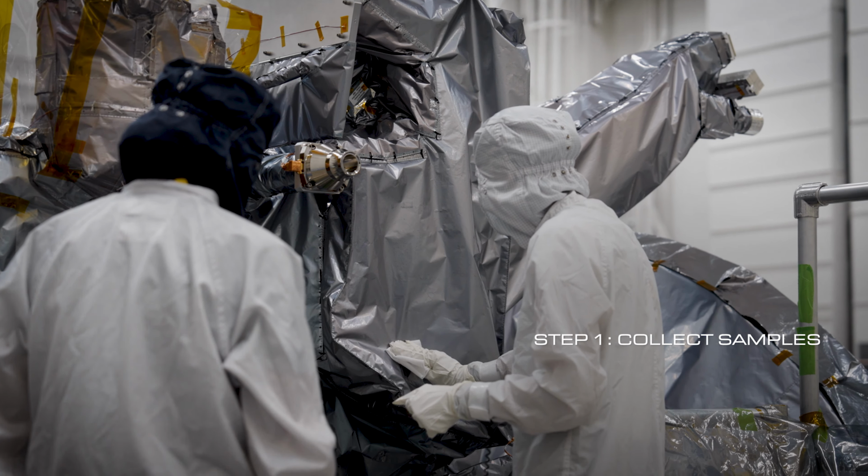And then we've moved to the next step, heat shock. What we're trying to do here is kill off all of the weaker types of bacteria and leave just the hardy bacteria. Next, we're going to filter this. The liquid will filter through, and the bacteria will stick on top of the filter. From there, we put that onto a plate of bacteria food, the consistency of Jell-O. From there, we let it grow for 3 days. We count every 24 hours for 3 days.